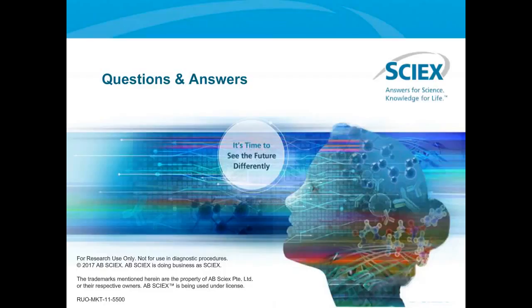Thank you. What about more complex triantennary or tetraantennary glycan analysis? At this stage, we were focusing on the biantennary structures of the IgG molecules because, as I showed in one of my first slides, that is what the majority of the industry is interested in. The next step will be going forward with tri- and tetraantennary structures and including them in the database as well.